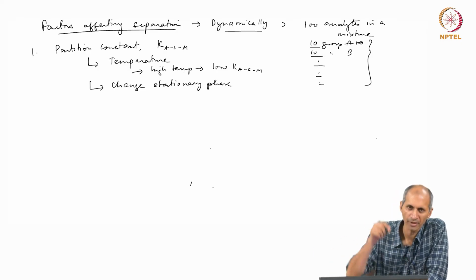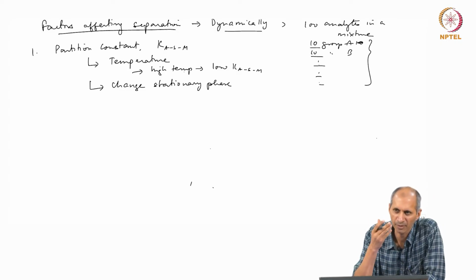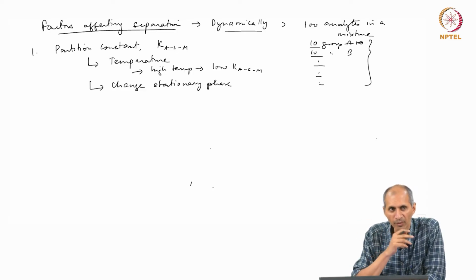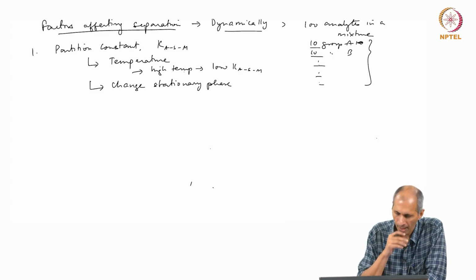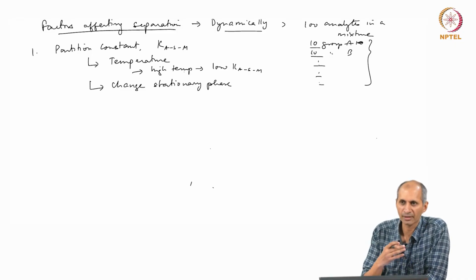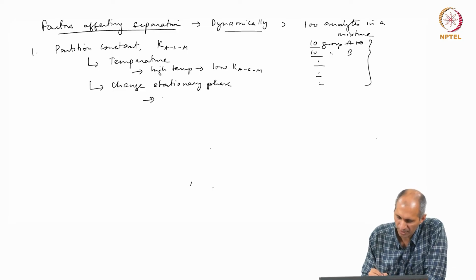Normally, when you inject a sample, it starts what is called a sample run. The sample is running through the column, it is a run. Within that time your goal is to do it all in one analysis, one shot. If you cannot, then you have to run it again with a different set of conditions. But the goal typically is to optimize the analysis, because analysis takes time, analysis costs money, and therefore we are trying to minimize all of that on a commercial scale.